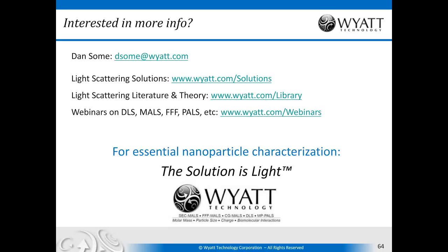for instance, your sample is a large particle and the medium is just smaller molecules, then you can separate them out very nicely and characterize each one individually. Now, if you need to look at the kinetics of something going on, then you might extract aliquots periodically. That's a good option. Or just leave them, for instance, in the dynamic light scattering detector over time and see how the changes occur. We are almost out of time, so this will have to be our last question.